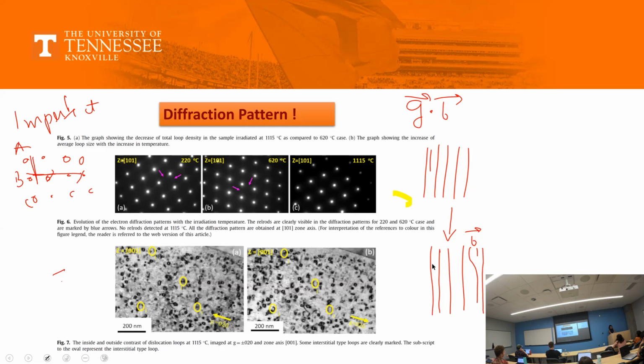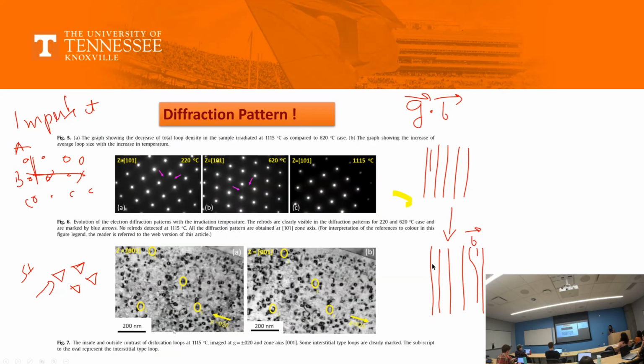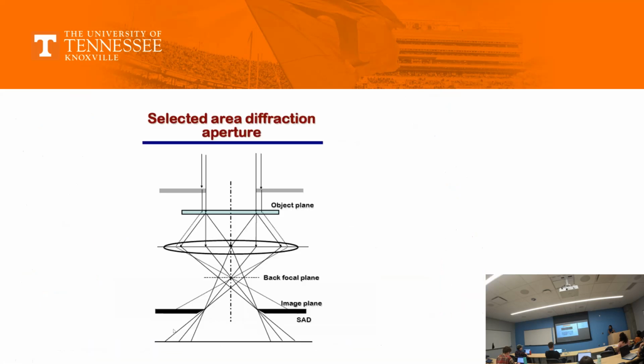And in microscopy, you see the stacking faults, if simple stacking faults, in some materials you will start seeing them as small triangles. If anyone is going a little bit into the papers, this is how you see them. I will start showing you. This is your stacking fault here. What's changing? Okay.